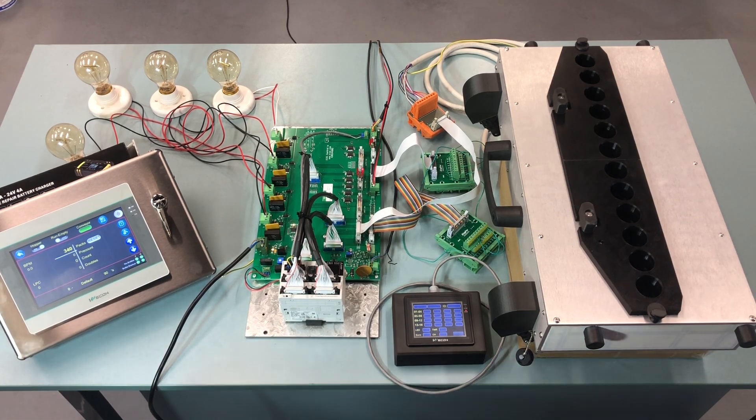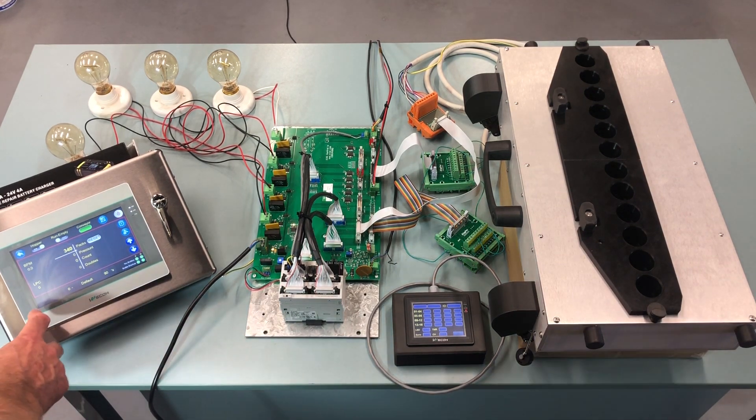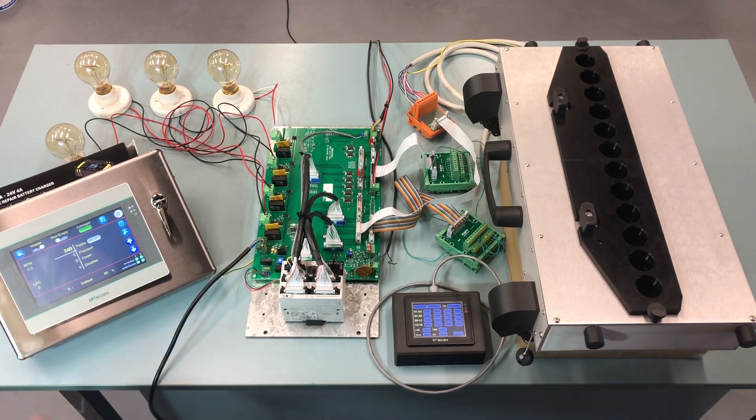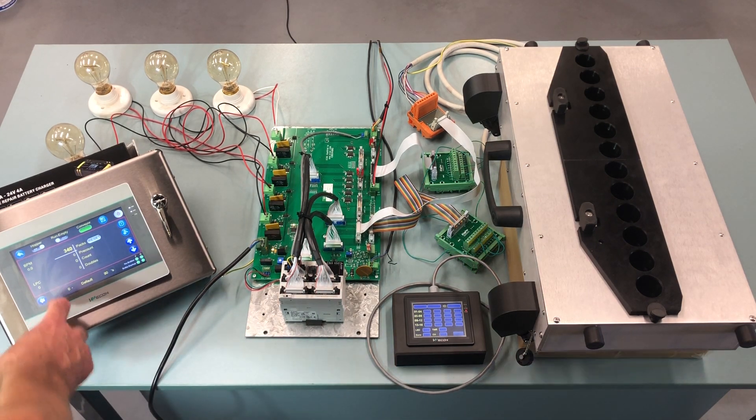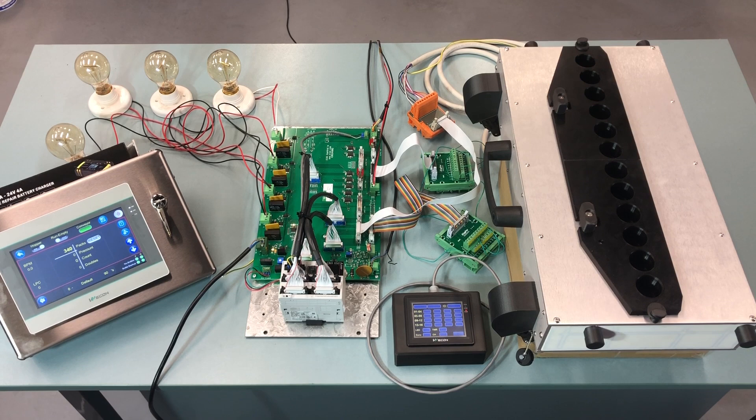Then we can reset the machine. We index one bottle from each track — one bottle from the front track and remove it, and we feed one from the rear track and remove that one as well. Now when we've come to this point, we are ready to start the machine.